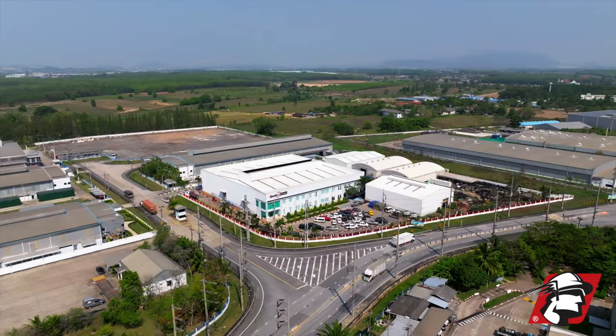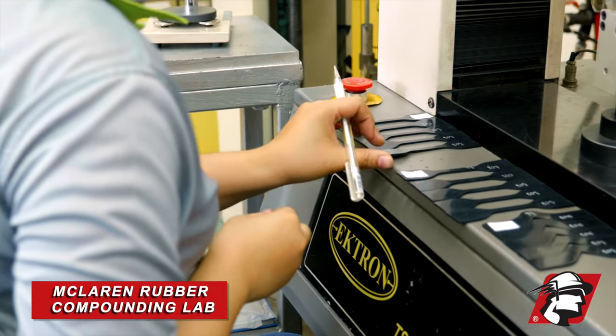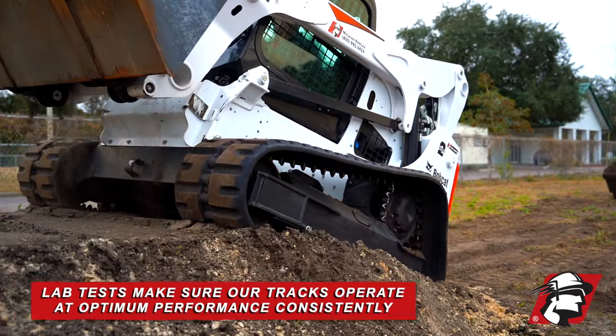RJ Doyle, McLaren Industries. We're behind the scenes here at the factory and we're in our rubber compounding lab. I wanted to show you a few things that make our quality better and make sure that every rubber track we make is at its optimum performance.